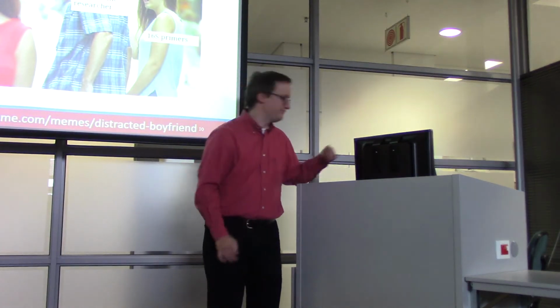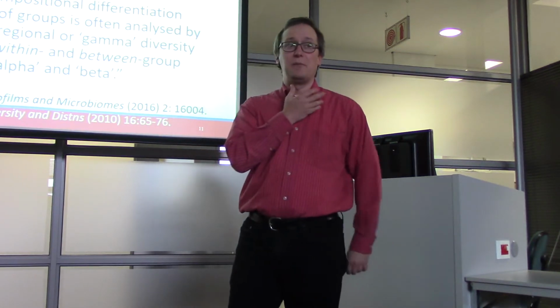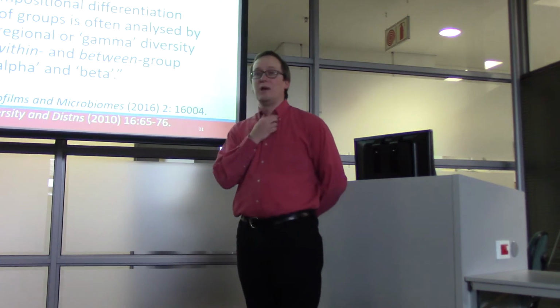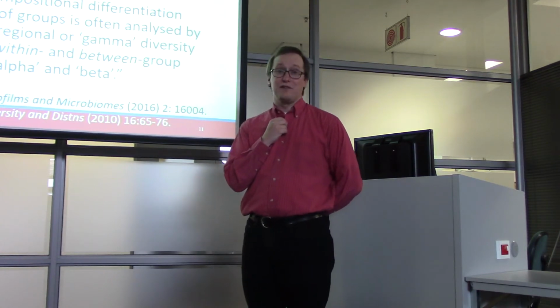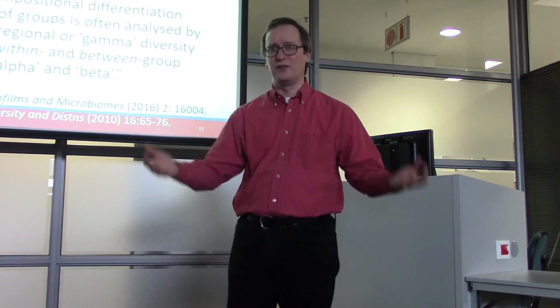Okay, so there are a couple of terms that show up aggressively in this literature, and I think that, for example, if I were writing a quiz question about today's lecture, asking what OTU stands for would be kind of an obvious question, because OTUs are something that a lot of this field rotates around.